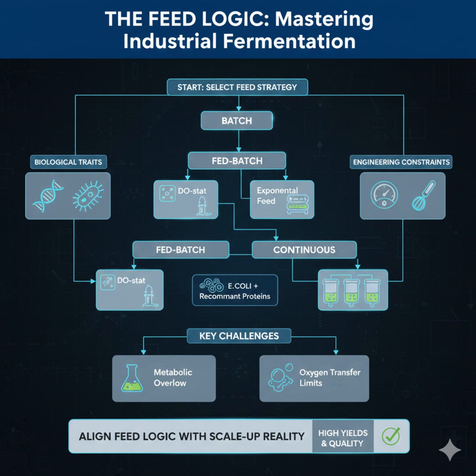And then finally, the ultimate technical ambition. Level 3, the advanced model-based strategies. If a DO-stat is so great, why would we ever invest in something more complex? Level 3 is really reserved for the highest value, high-risk processes where the cost of a batch failure justifies an immense investment in instrumentation and validation. These strategies require real-time biomass sensors, robust soft sensors, and comprehensive predictive models.